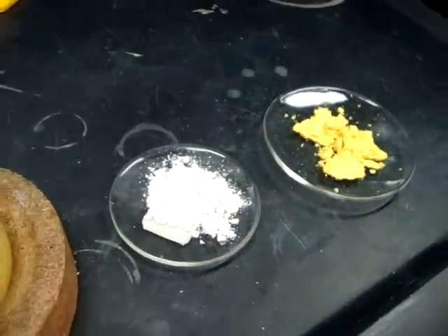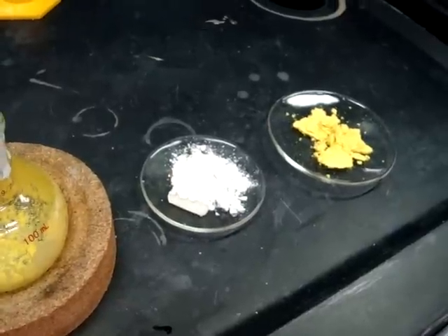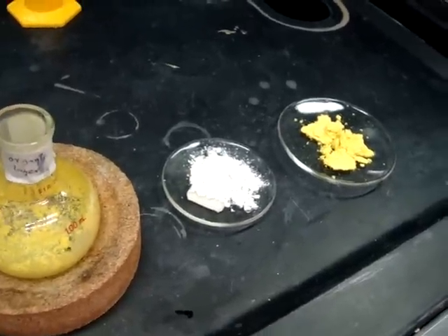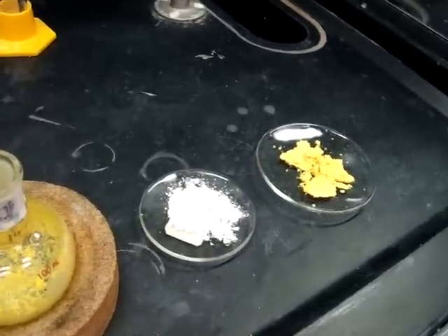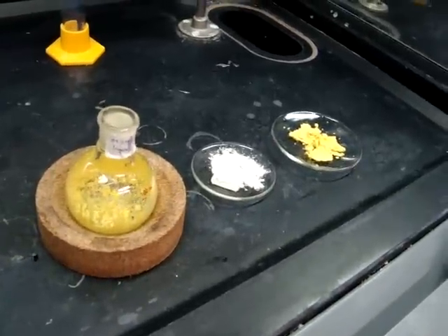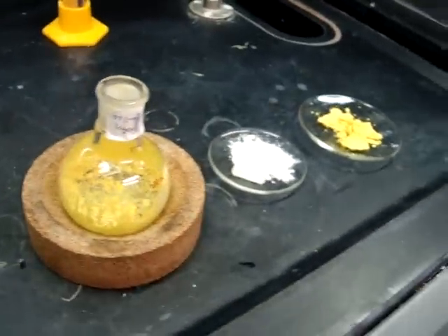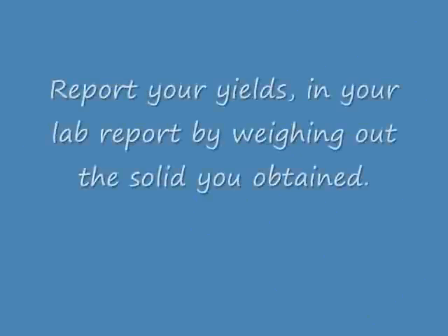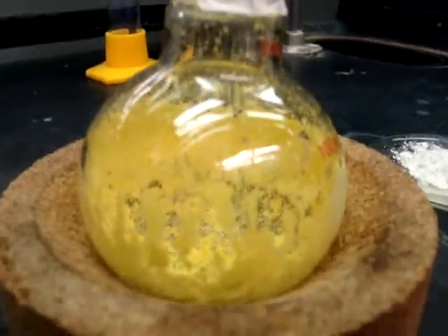Make sure before you transfer the compounds from the Buchner funnel to the watch glass that you weigh out the watch glasses and record their weights. Then transfer the compounds to the watch glasses and leave them in the oven for 5 to 10 minutes so that all the excess water is removed. Then you can weigh the compounds on the watch glass in the back of the room to record the total weight. Here we have the biphenyl, the benzoic acid, and the P-nitroaniline.